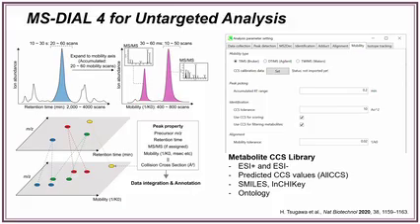What they're doing is similar to how the Skyline process works: it's identifying the chromatographic peaks first and then expanding that into the ion mobility dimension. This example is showing that at one particular retention time, when they look in the mobility dimension, there are actually 2 mobility peaks, and so that gets split into 2 features that have 2 different drift times.